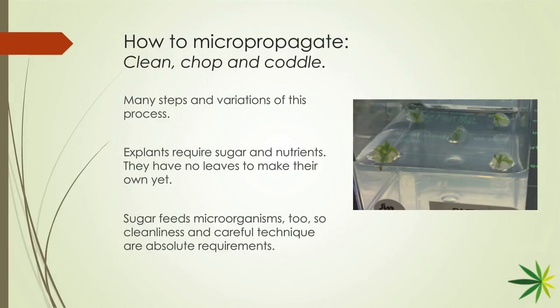Okay, now at this point in the process, this is where you could store long-term genetics and slow the growth down. As we go back a few slides, we're talking about slowing it down. Is this the stage you would do this at for long-term storage? One, because it's such small plantlets, and two, you can put a lot in this space. And this is just one of the methods for storing genetic material long-term. I'm just focusing on the micropropagation method, again, because it's the most accessible. I'm trying to get this kind of information out to a big audience. The method that you can use is the one you should use.